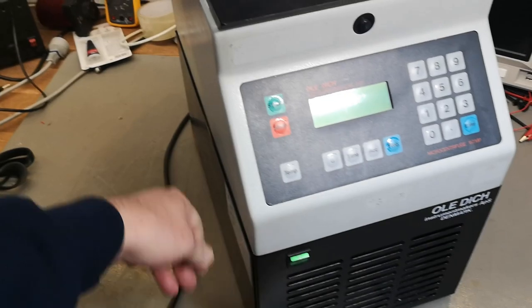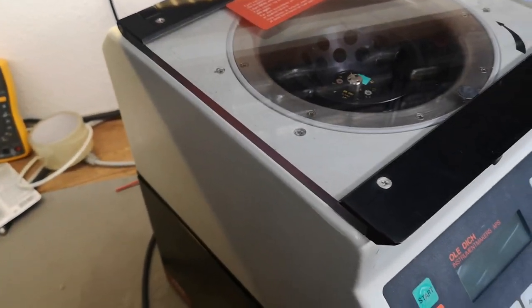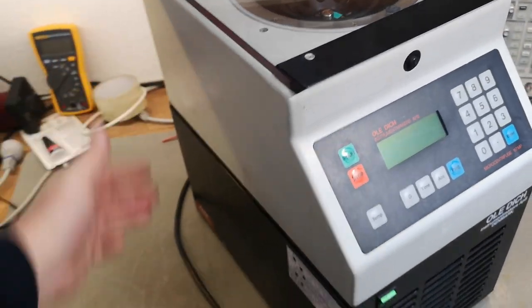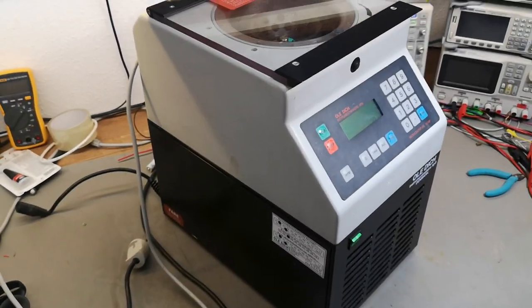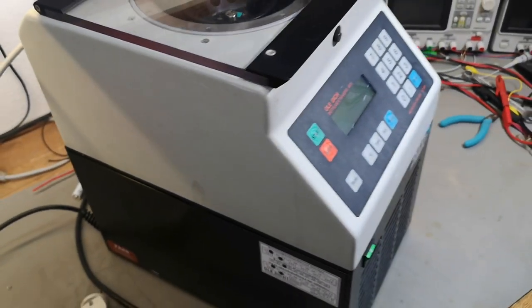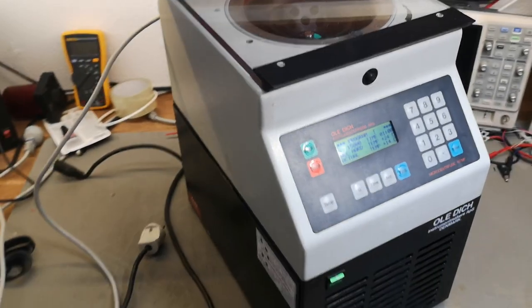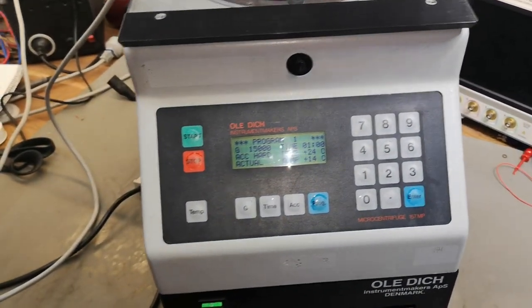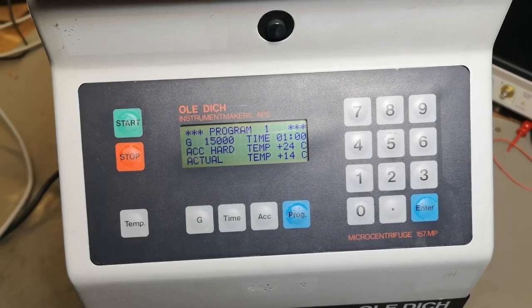Mains applied and then cranking the switch on the back — nope, no response at all, not a single bleepity bleep. New experiment: let's take a power cord and go straight into the top connector and see if it blows up that way. That power switch down there is definitely the problem.